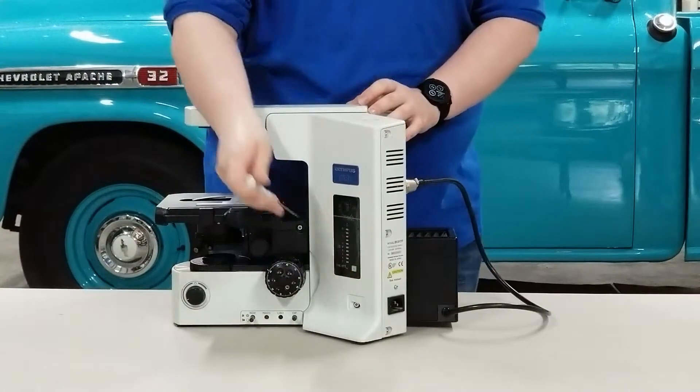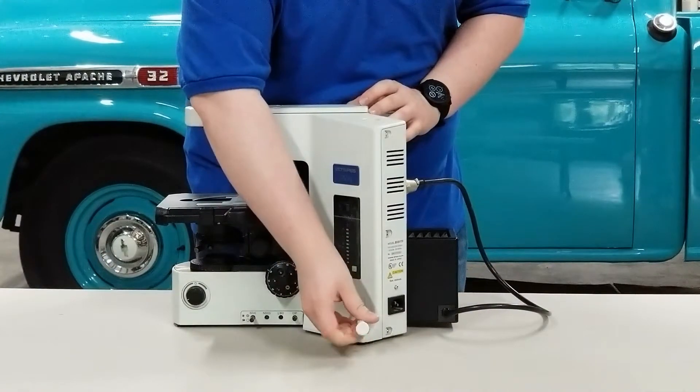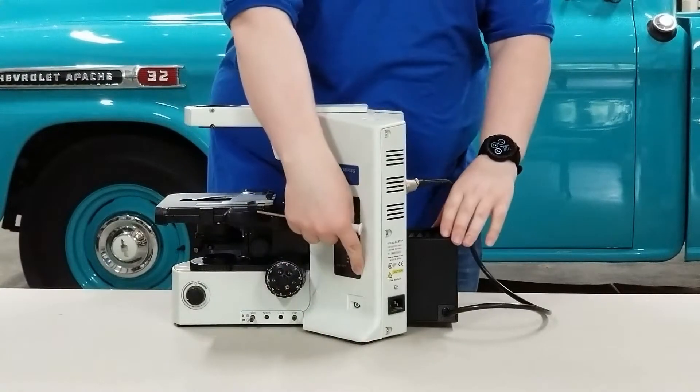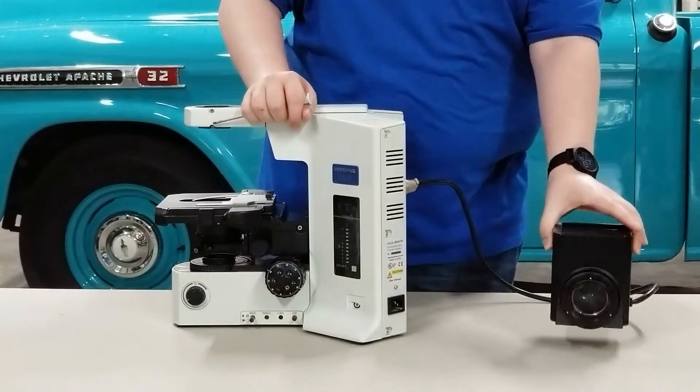What you want to do is take your screwdriver, slip it in, and just loosen the screw a few turns — it'll actually stop itself for you — and then you just wiggle the lamp house and take it out.